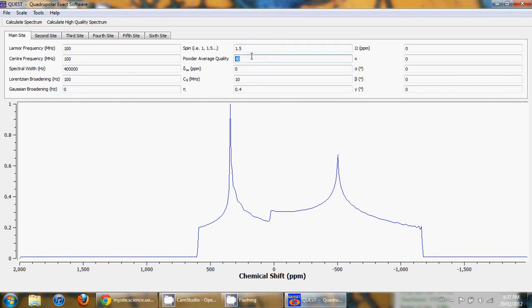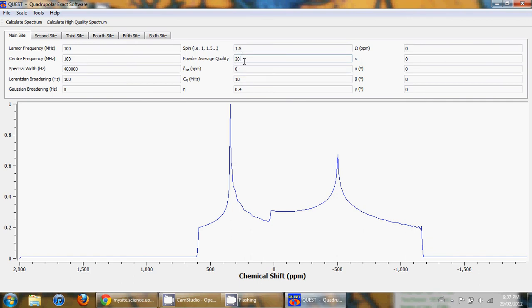You also have the ability to change the powder average quality in Quest, the number of crystallite orientations that you calculate. What this parameter actually does I will discuss in the next episode when I discuss the theory.